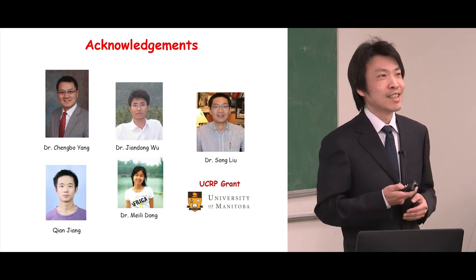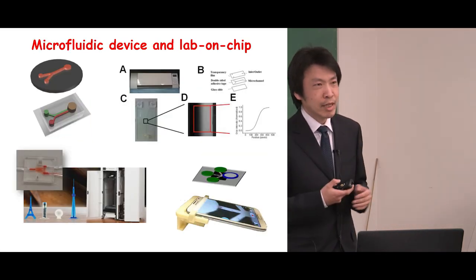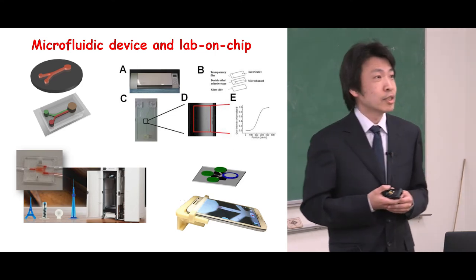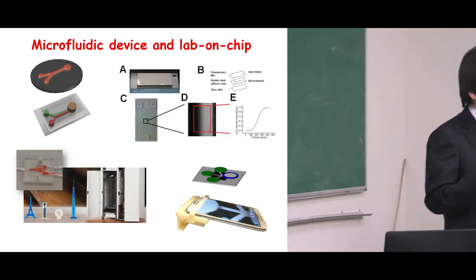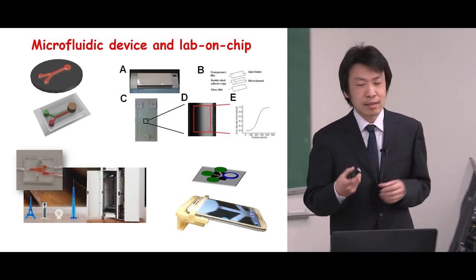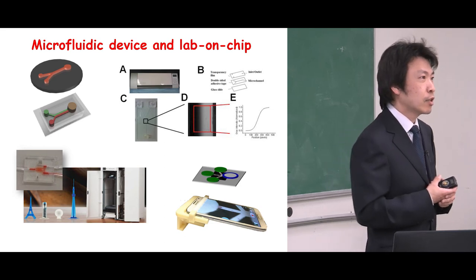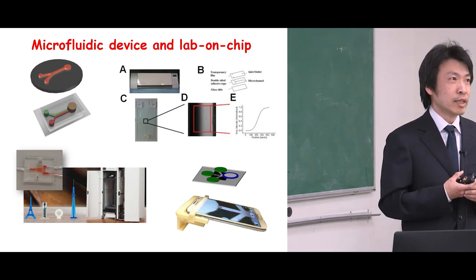Okay, so our strategy to address the challenge of mycotoxin detection is to use microfluidic devices, or sometimes people call this the lab on a chip approach. Basically, with those devices, we can fabricate very small channel structures on a miniaturized device where we can control the environment, and we can do interesting experiments that have much relevance to bioanalytical analysis, biology, and many other life science related research.